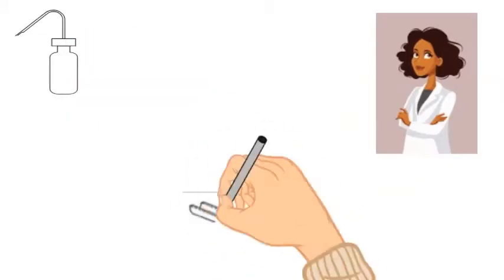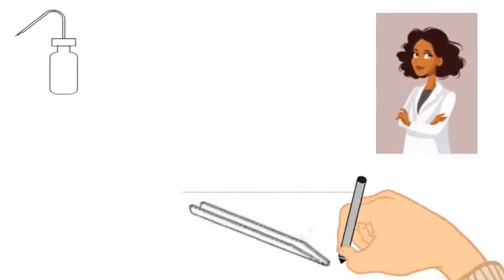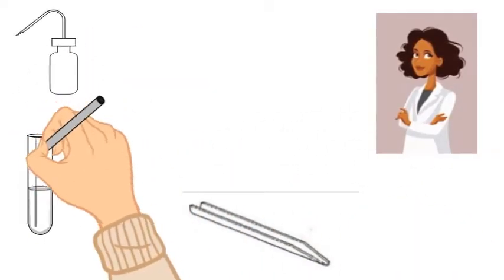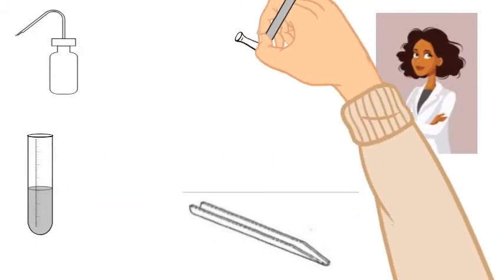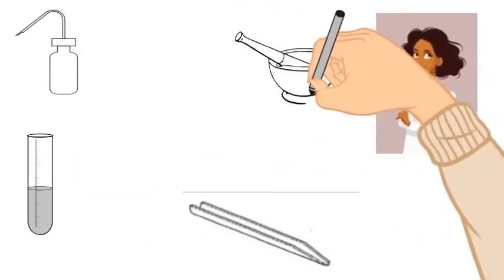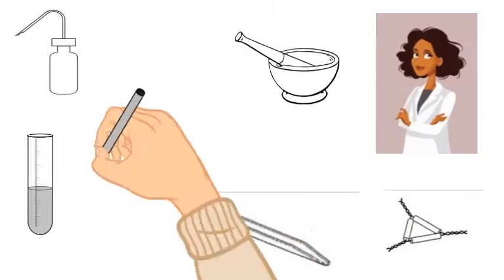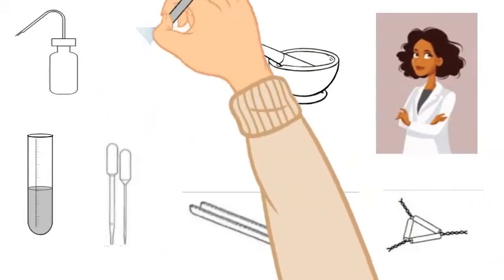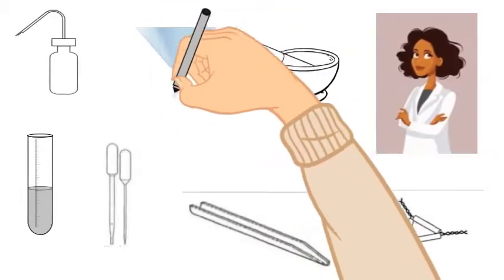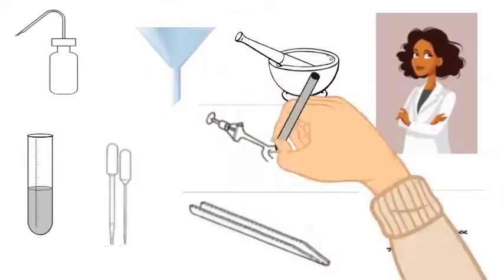Some other equipment which we will be using is the wash bottle which we will fill with distilled water, the spatula or scoopula to handle chemicals, the test tube, the mortar and pestle to grind chemicals, the clay triangle so that we can heat or hold a funnel, the transfer pipettes, and lastly the funnel and the ring which goes on the ring stand.